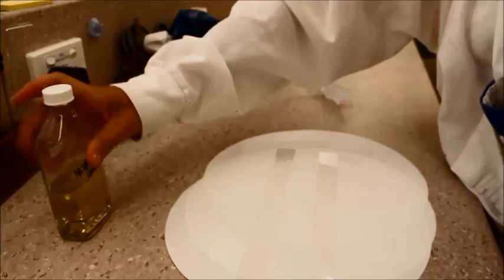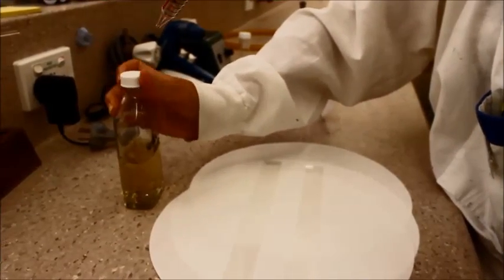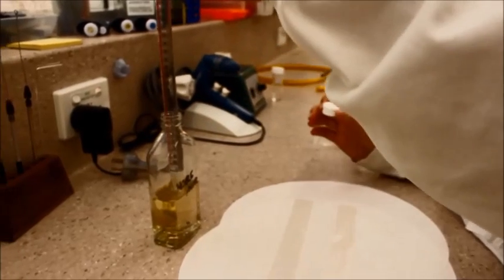Then, using a 25ml pipette, pipette 15ml of molten noble agar onto the gel bond.